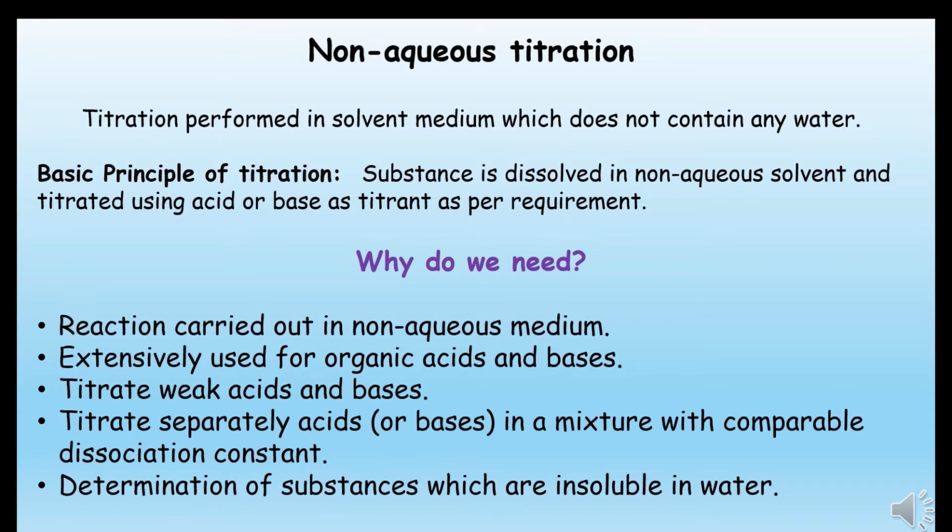So why do we need non-aqueous titration? Basically, if the reaction is carried out in a non-aqueous medium, we need it. It is extensively used for organic acids and bases.